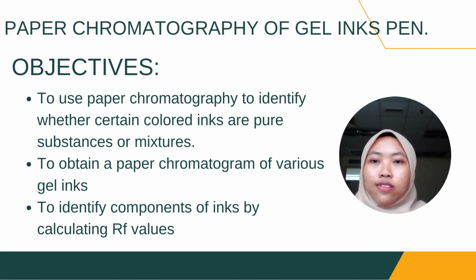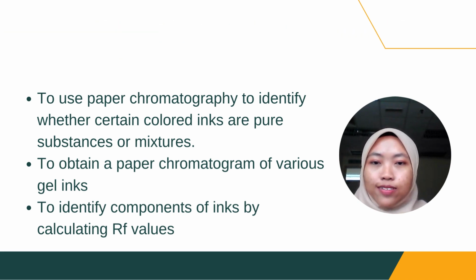We conduct this experiment to identify whether certain color inks are pure substances or mixtures, to obtain a paper chromatogram of various gel inks, and to identify components of inks by calculating RF.